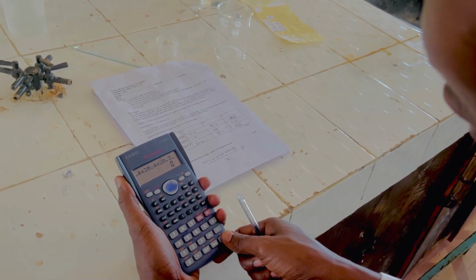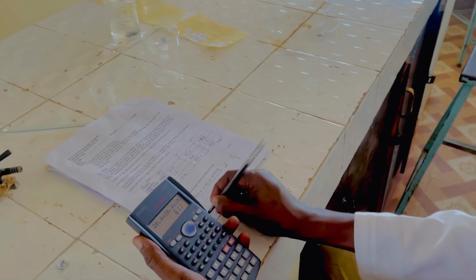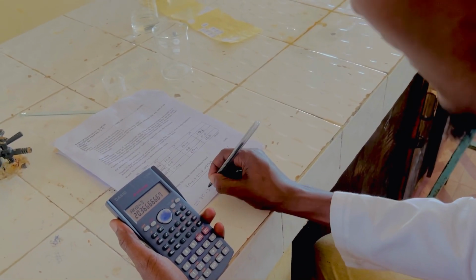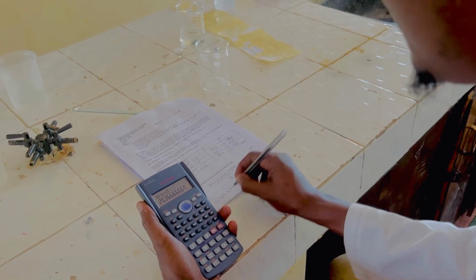Then I will get a total, then divide by 3, and it equals 20.366 centimeter cube.